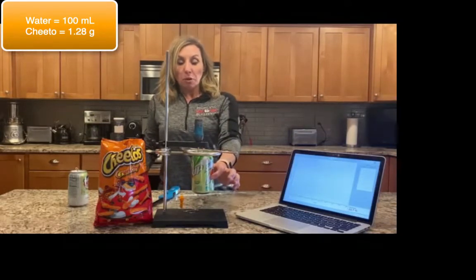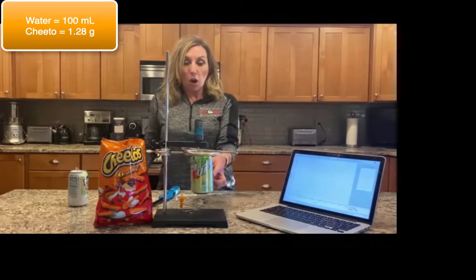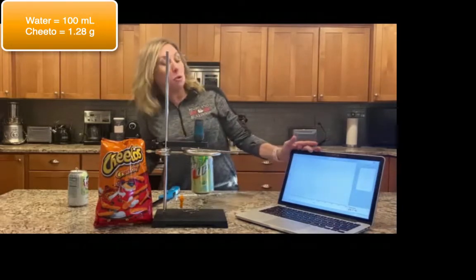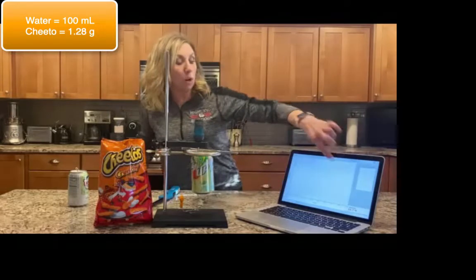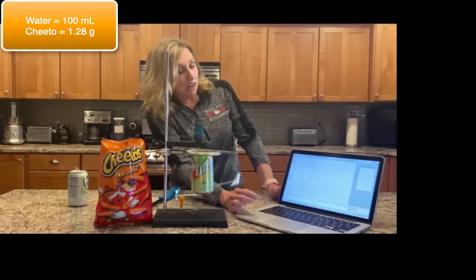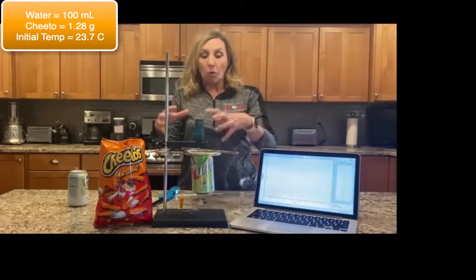This is my calorimeter. Inside of the can, there's 100 milliliters of water. And right now I have a temperature probe that's connected to the computer over here. So my initial temperature is 23.7 degrees Celsius. I'm going to start collecting the data so that it collects the data as the temperature changes. And I will post the recording of this video along with this so you can watch that as well.